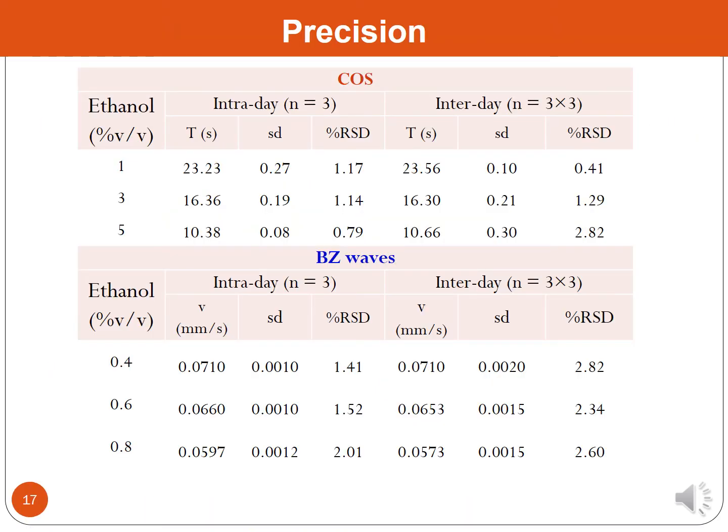We have tested the precision of two methods, both COS and BZ wave.